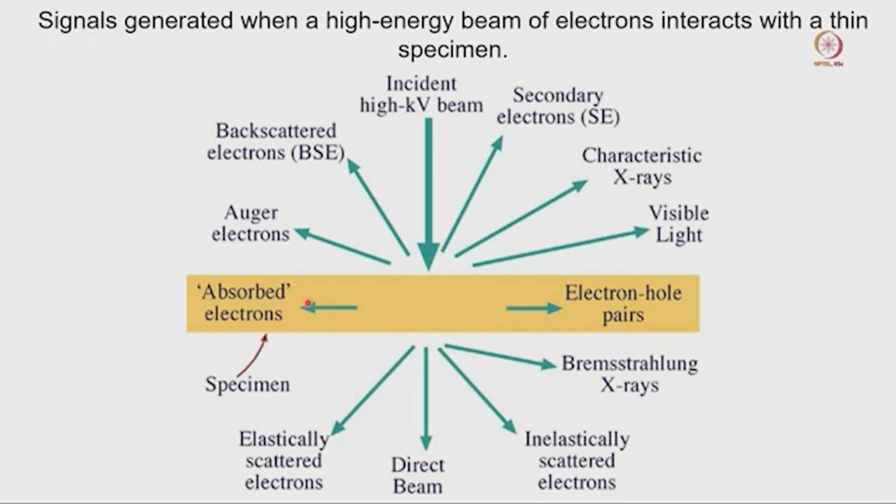So, if the sample is not very thin, chances are very high the incident electron beam will interact and a lot of energy will be absorbed, and that will damage the sample. One more thing: whenever we are imaging a biological sample, we cannot expose the sample for a long time. There is a short time exposure, and we have to use that.